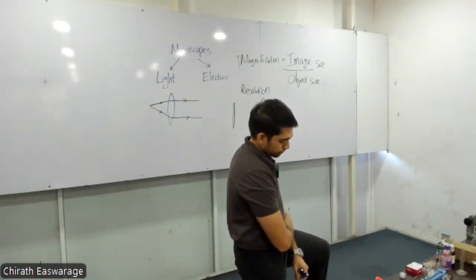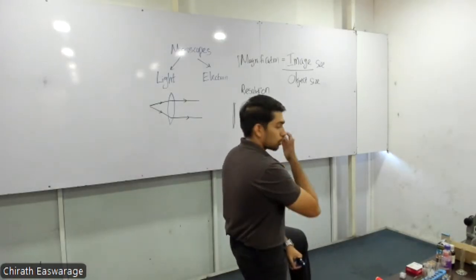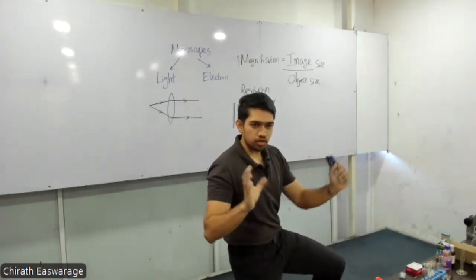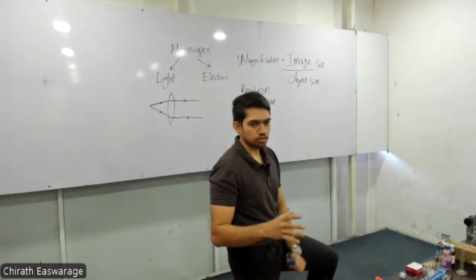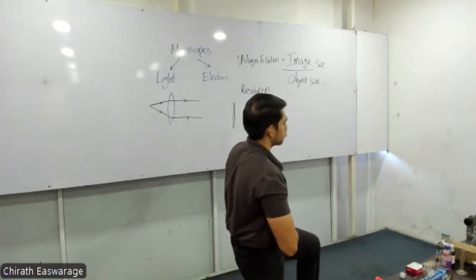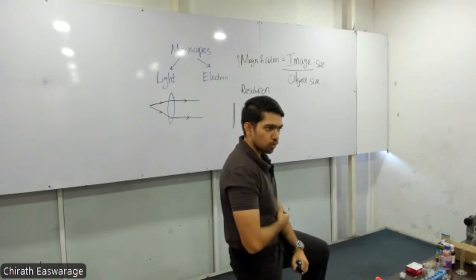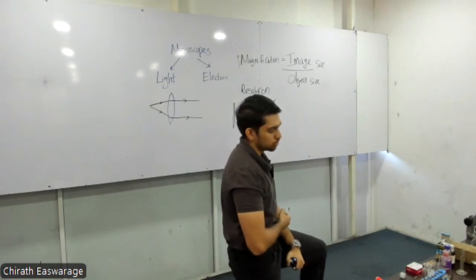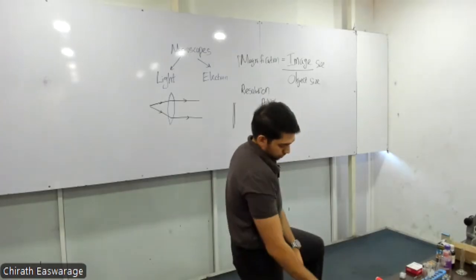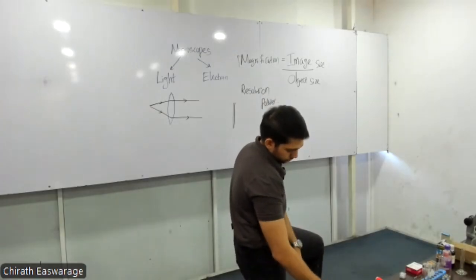Magnification is limited due to resolution, right? No matter how much you can enlarge the image, if that image is not clear, it's useless. Get it? So no matter how much you can magnify, if your resolution is low, then it's not useful. Okay. So keep reading. We are on page 23 now.